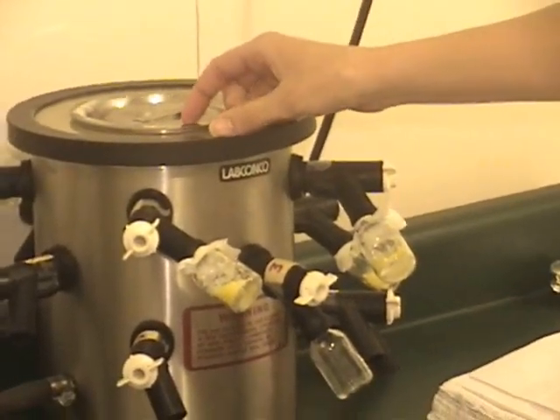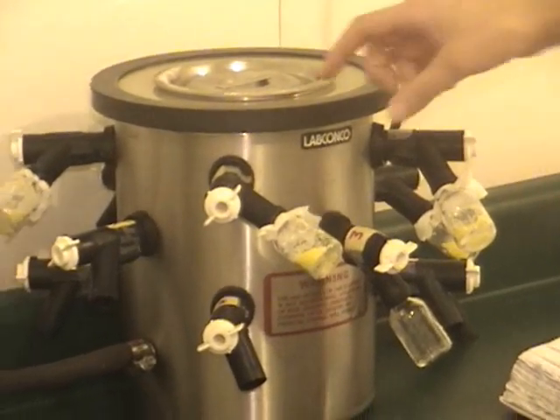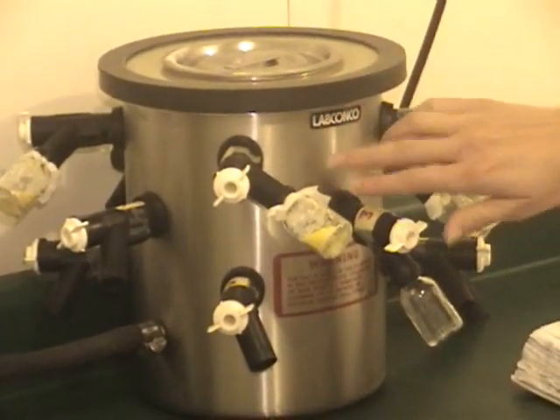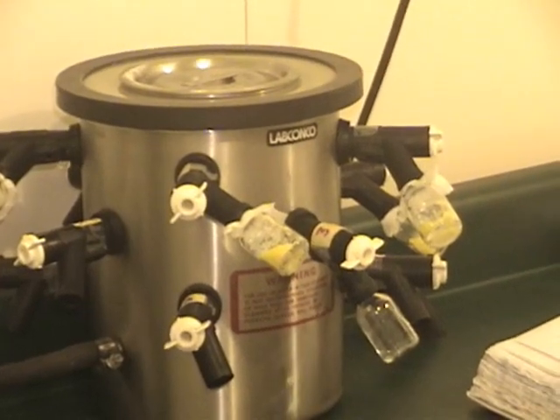There's a space here, and the whole thing is hooked up to a vacuum pump. It basically creates a vacuum in this space and sucks the liquid out of the venom, and it's collected in here. It's frozen because of the dry ice in there, so it doesn't go into the vacuum pump.